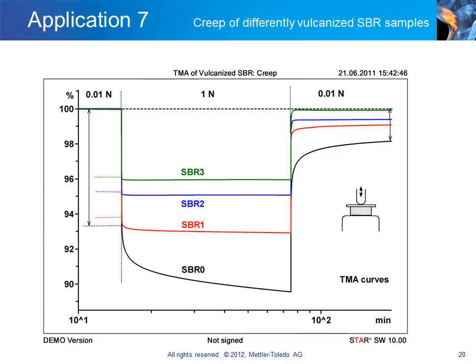Creep deformation consists of two components: reversible creep relaxation and irreversible viscous flow. The former deformation is restored over time when the stress is reduced or removed. Viscous flow, however, causes permanent deformation and geometry change and often leads to product failure.